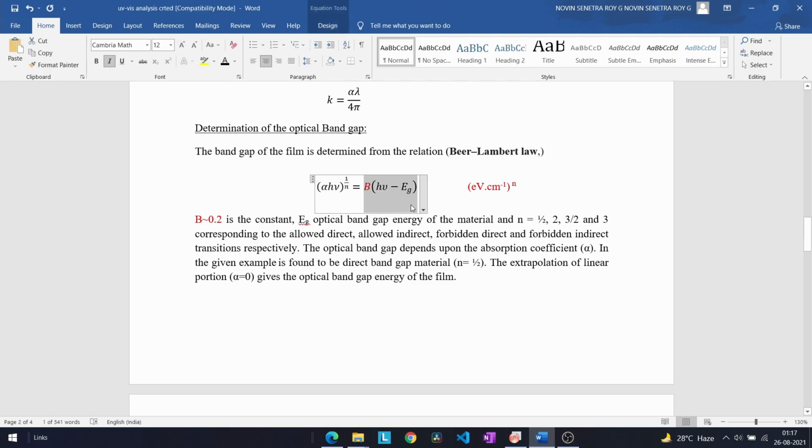This is a linear equation derived from the Beer law, where the same has been found using a linear fit. They analyzed what the best fit for the curve is, using a linear fit model, given as a linearly dependent equation, something like this.